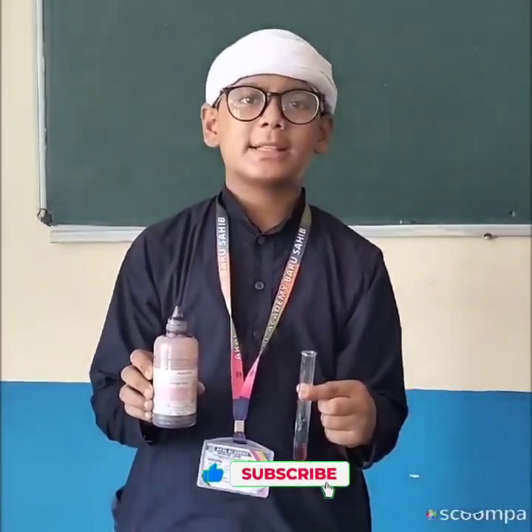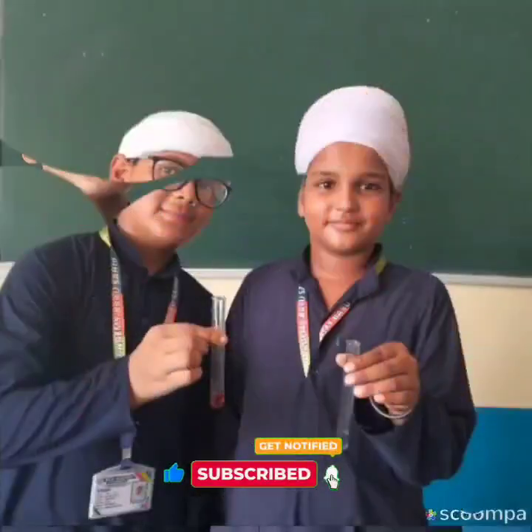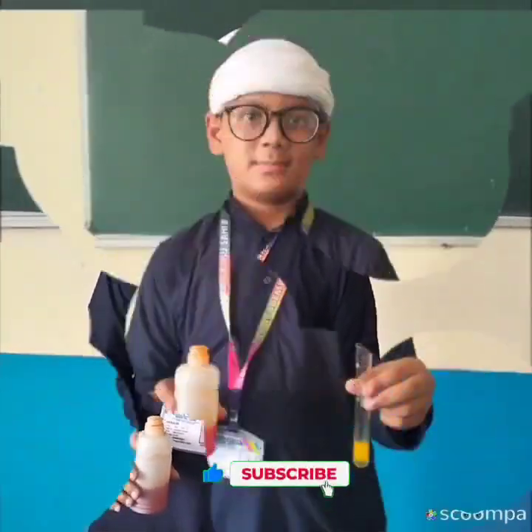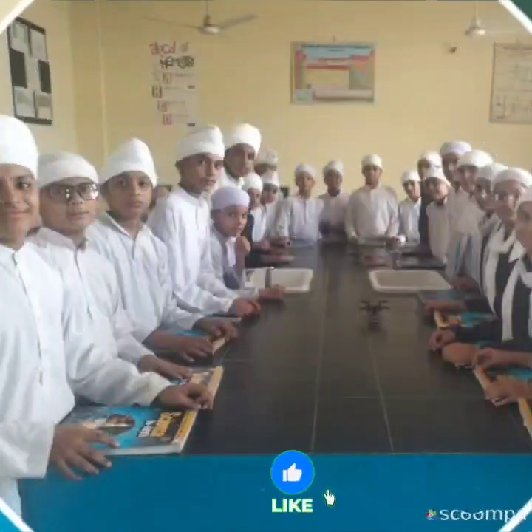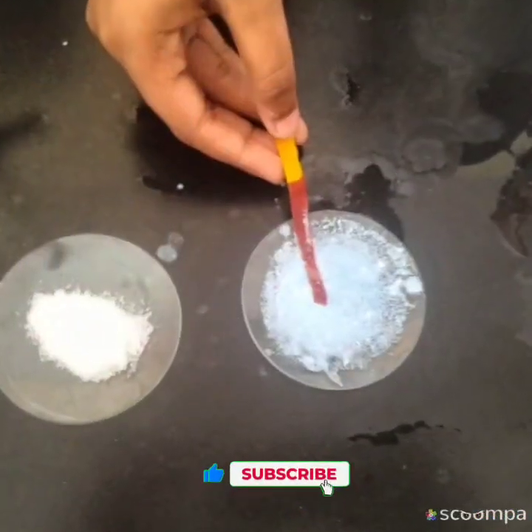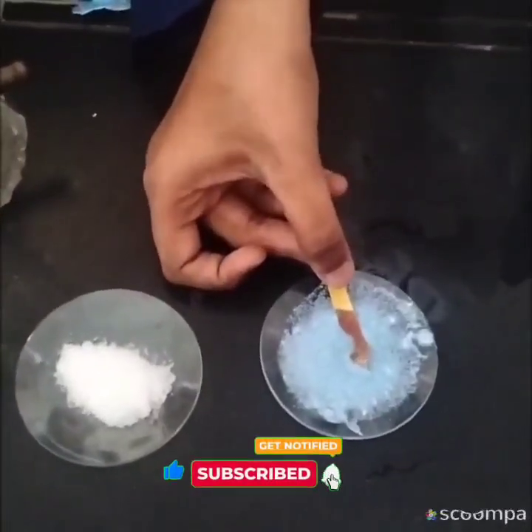Red litmus remains red in acid. Red litmus turns blue in basic medium. Methyl orange turns red in acidic medium and yellow in basic medium. Turmeric turns red in basic solution.